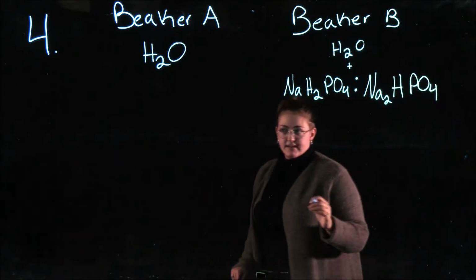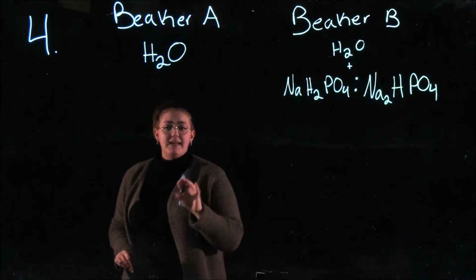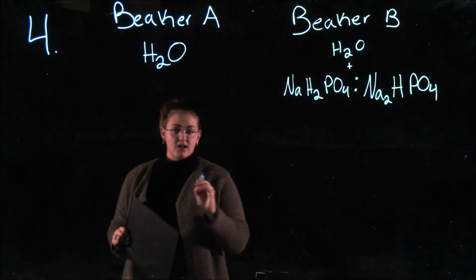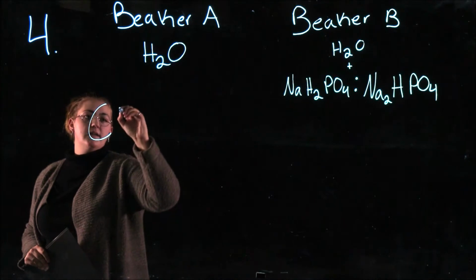So the question is, when we add carbonated water to both beaker A and beaker B, what is the pH difference going to be between the two? And what kind of magnitude of pH changes is the carbonated water going to have in beaker A and in beaker B?